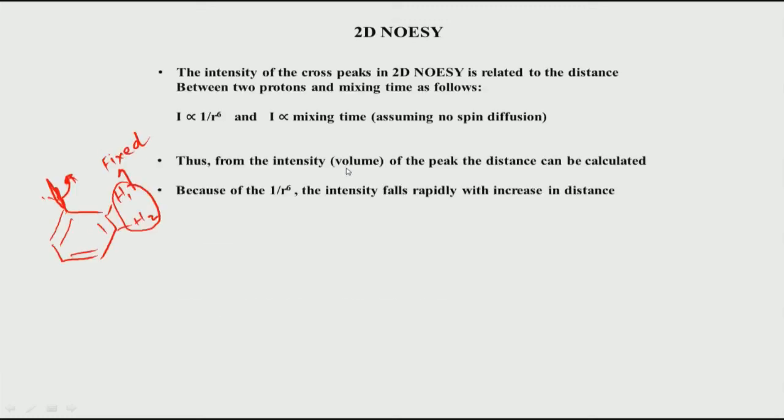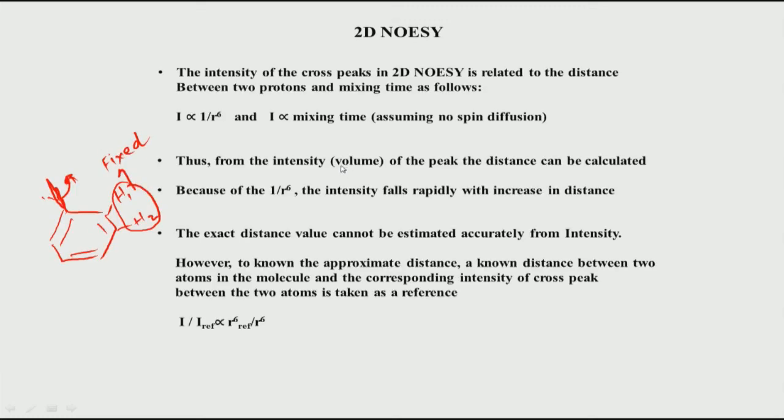So, therefore, exact distances may not be required. In fact, we will see down the line, when we look at the application of NMR for structure determination, you really do not need exact distances between two atoms from NOESY. All you need is information on whether they are close or far. Of course, the moment you see a cross peak in NOESY, remember they are less than 5 to 6 Angstroms, but within less than 6 Angstroms there can be a variation, it can be 3, it can be 2.5, it can be 4 and so on.